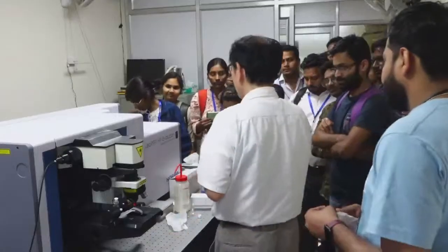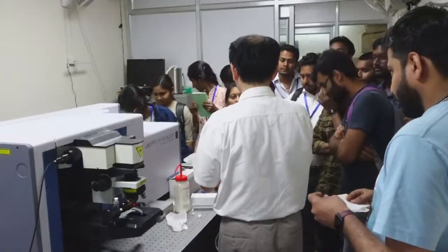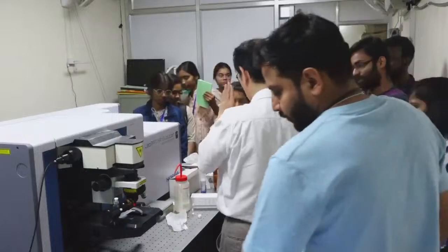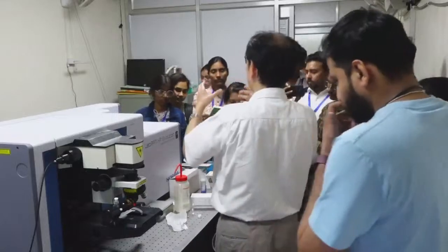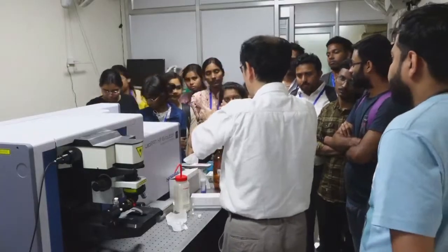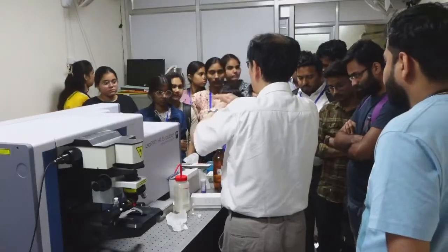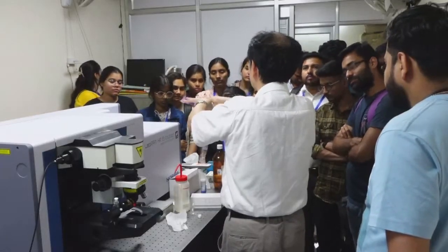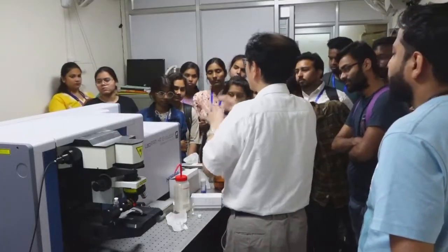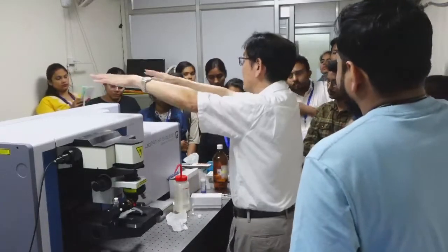In order to measure the Raman spectrum, we need an excitation laser and a sample cell, and we need to collect the scattered light and deliver it to the monochromator. Then a grating disperses the mixed color into each color. Then we detect the Raman signal. Everything is in this box.